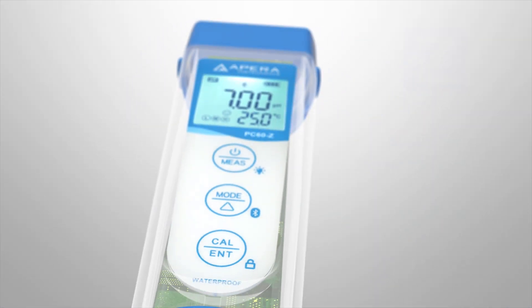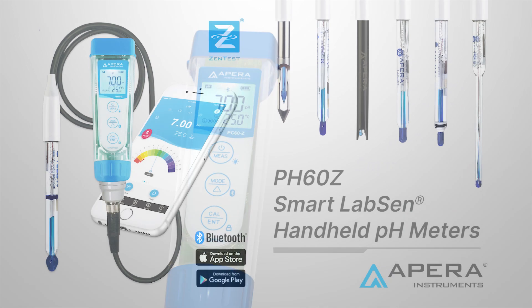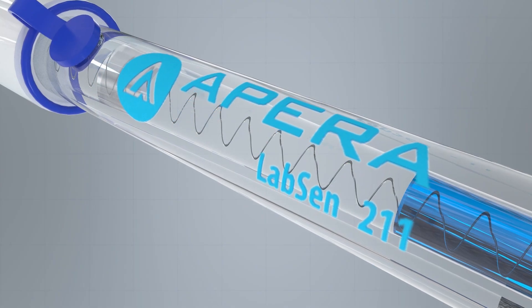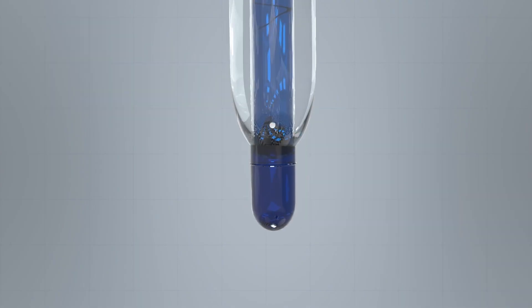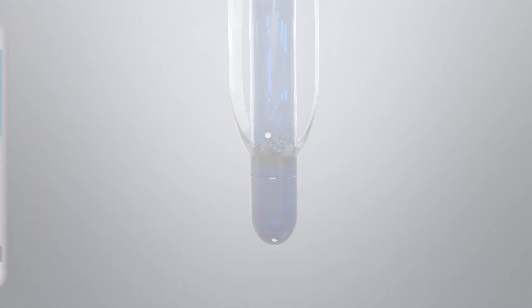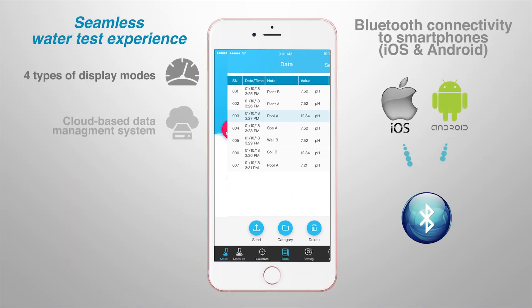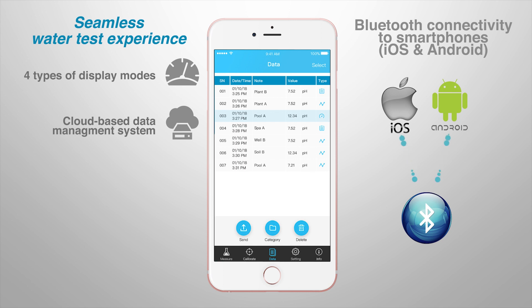Discover the next level of precision, portability, and smart data management with the top-rated Apera Instruments Smart PH60Z Tester, now paired with the LabSen PH electrodes. Seamless water test experience powered by the Zintest Mobile App, available on Apple and Android devices.